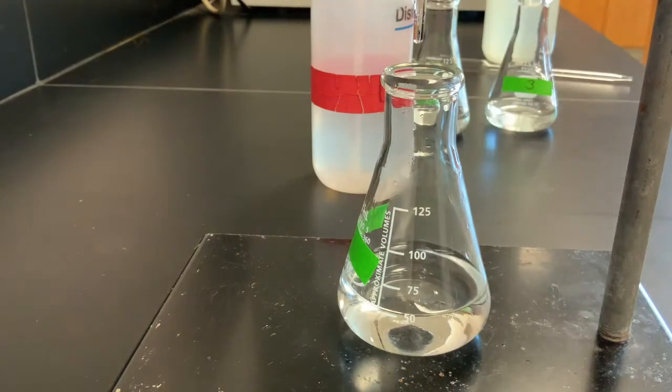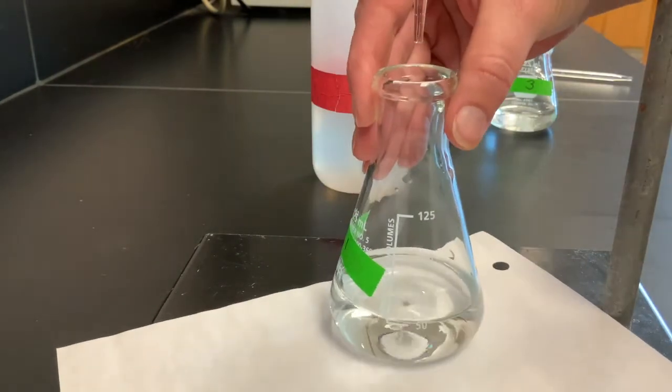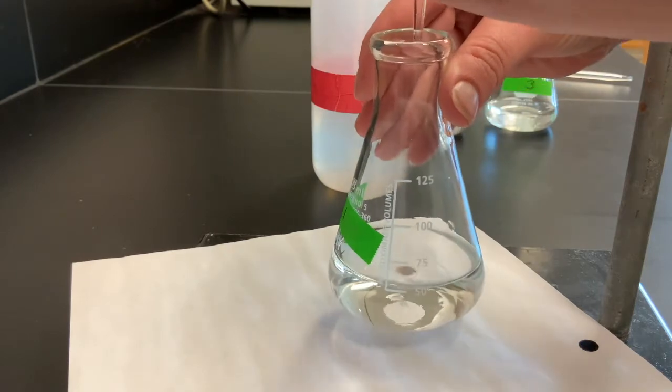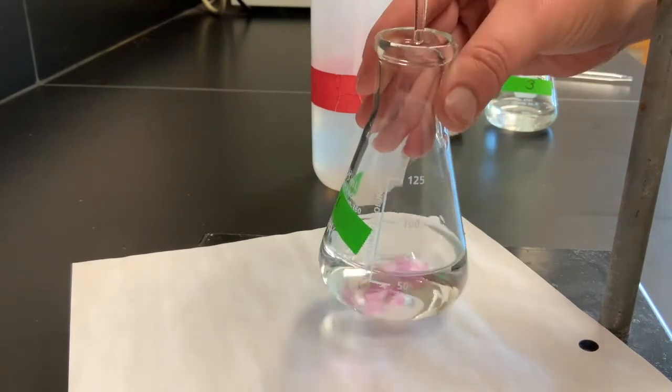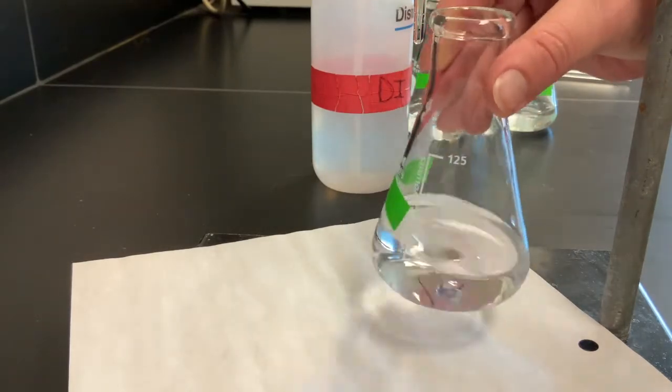Now, sometimes this pink can be hard to see. Sometimes it's helpful to put the white can help us see the pink a little bit better. So see, we've got some pink that's starting to kind of swirl around.